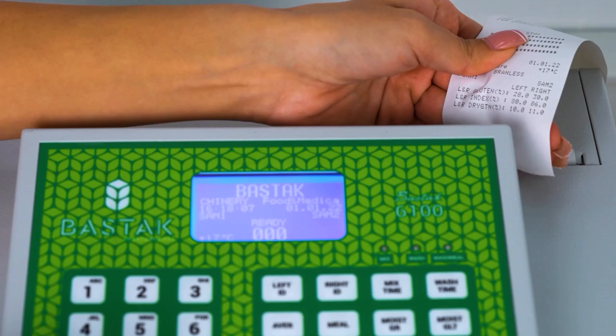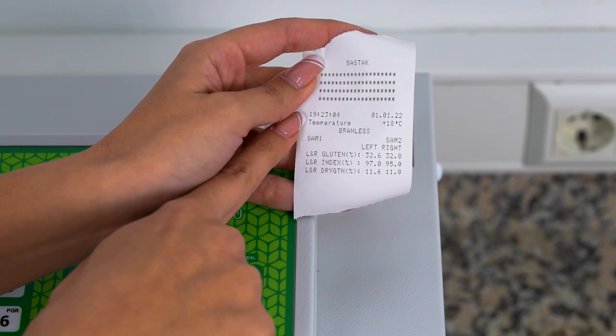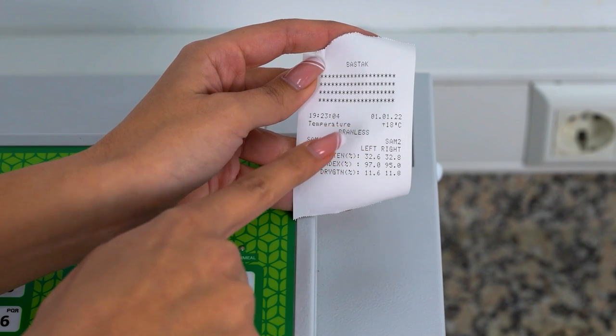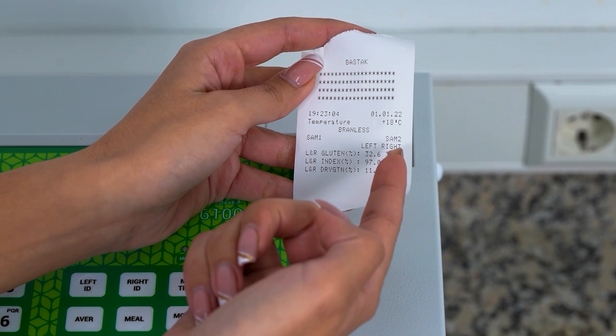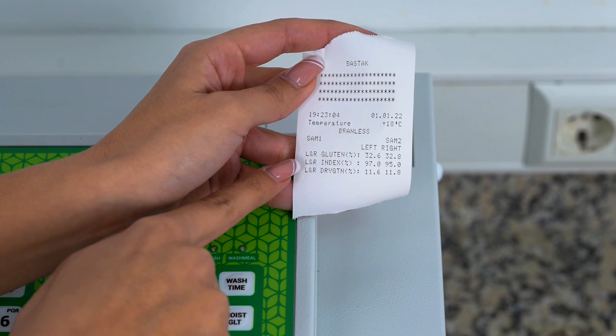The printer printout contains company information on the upper part of the paper. In the second line, the time on the left and the date on the right. In the third line, ambient temperature. In the middle of the fourth line, sample type. In the fifth line, the left sample name on the left and the right sample name on the right. In the sixth, seventh, and eighth lines, wet gluten, gluten index, and dry gluten values are seen.